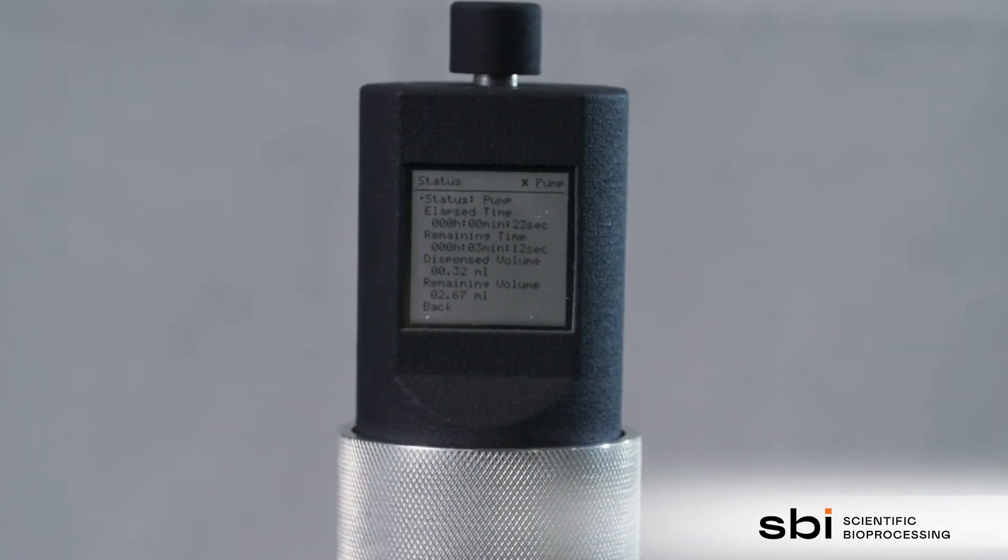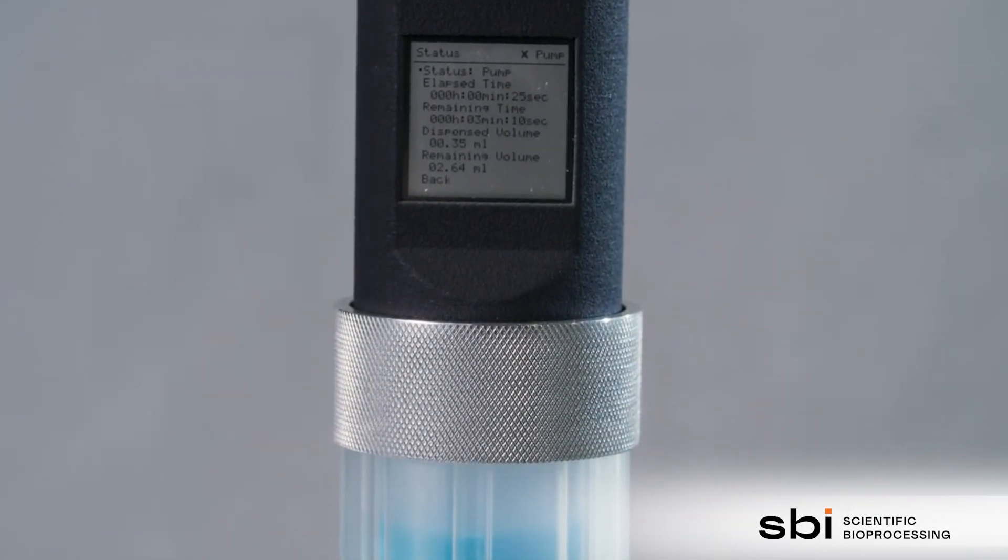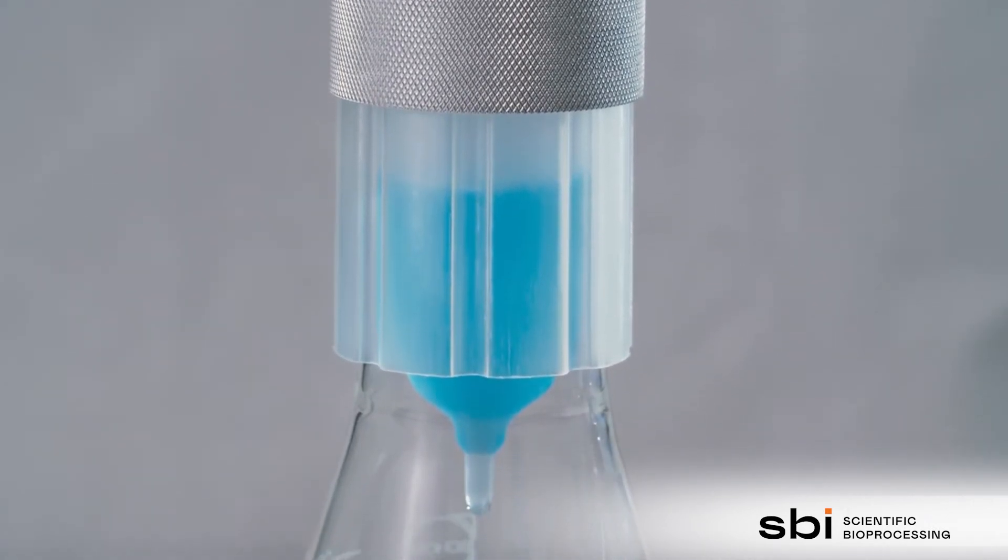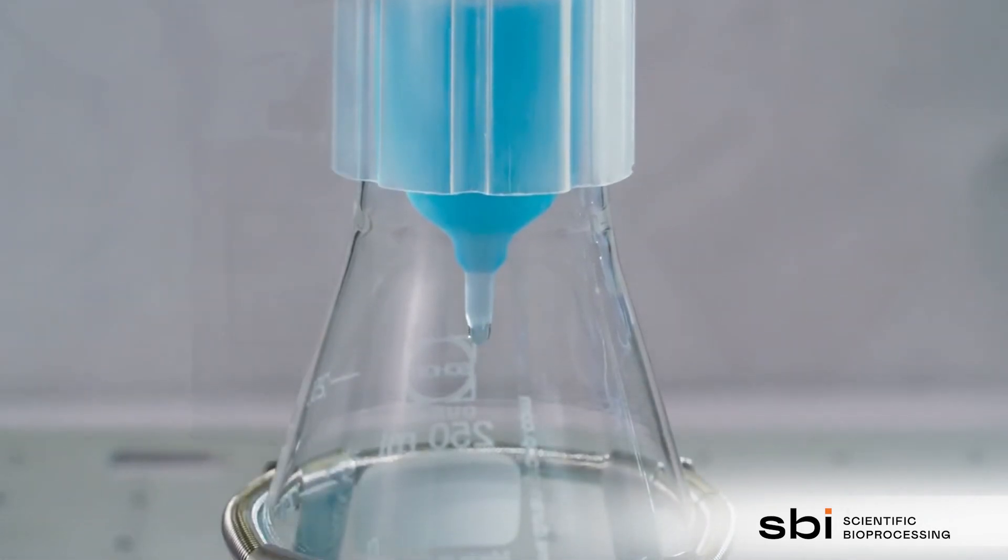Since the drive only pumps air and not the liquid itself, it never needs to be cleaned or sterilized. Hence, the LIS drive can be used in a plug-and-play manner.